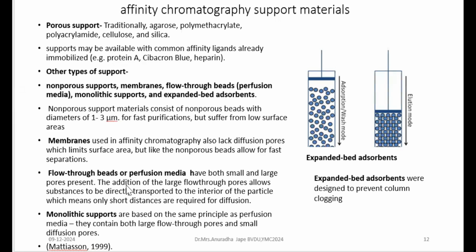Monolithic supports. When you talk about monolithic supports, their principle is similar to perfusion media. They have both large flow-through pores and small pores, so in monolithic supports you are going to have diffusion pores. An even more advanced version is expanded bed adsorbents. In this, as you are seeing in the diagram, in the first column the bead particles are separated from each other, and they are almost up to the complete height of the column, and this is the pressure pump, right?